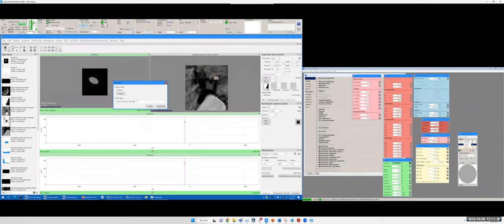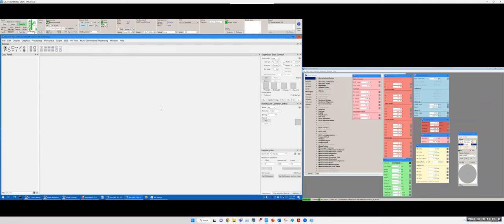You can see it automatically generates a folder name. Then you can add some information to this folder name, like training on ACTS code. Then you click create project. You can see this is the position, this is the new folder, create project. Okay, you can see the former project is closed and now you can see a blank project. That is the default look of this blank project.